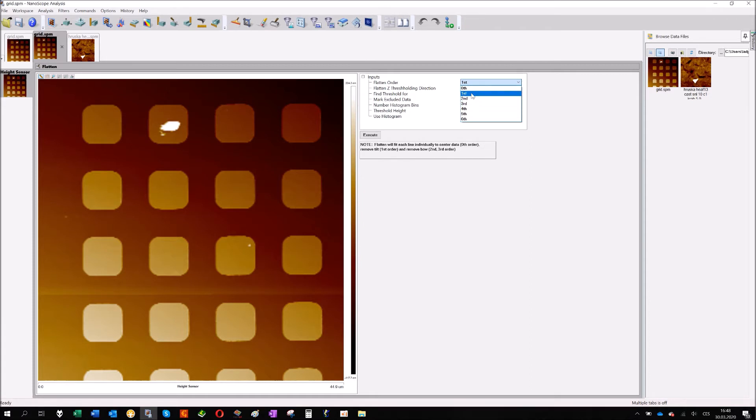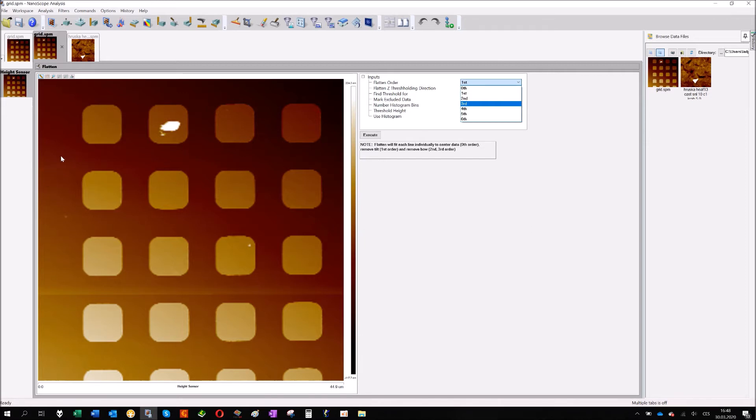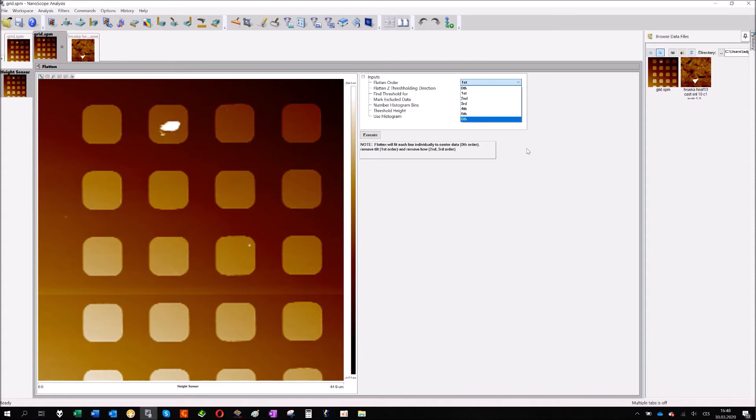You can also apply higher orders, for example second, which is not a line anymore, it's some bow, it's a curve. So it will move, for example the middle will go up and the edges will go down. You can apply it if your sample is really curved, you are measuring some lenses or something like that. Then it makes sense to use second or even higher order. But generally be careful using higher orders because you can very easily introduce artifacts with your post processing of your image.